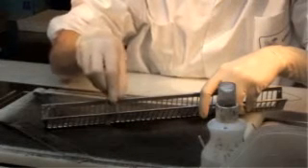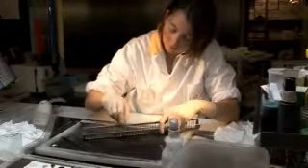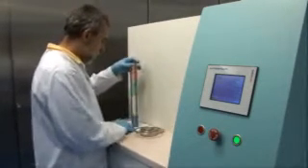In a histology lab, samples are cut into small pieces. These pieces are placed in small cassettes, which are placed in a rack. The shape of the rack enables easy scanning, bringing batch control and track and trace features within easy reach.